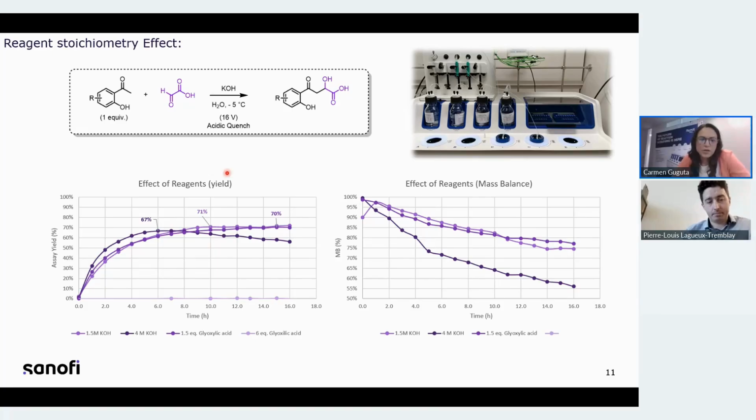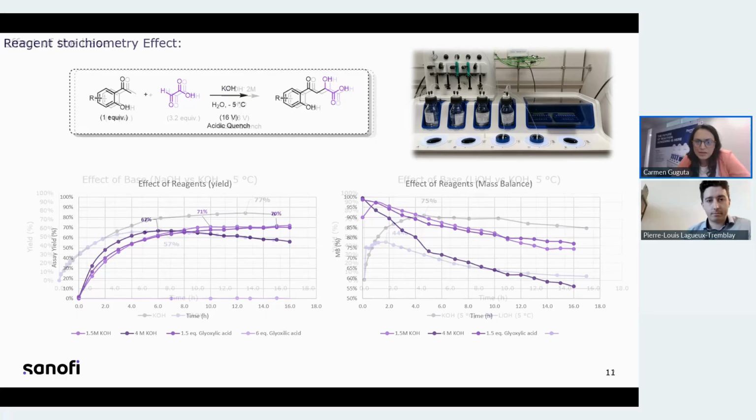Thank you. Can you comment on definitions of yield and weight percentage? Do these values need to be multiplied together to obtain mass of desired product?